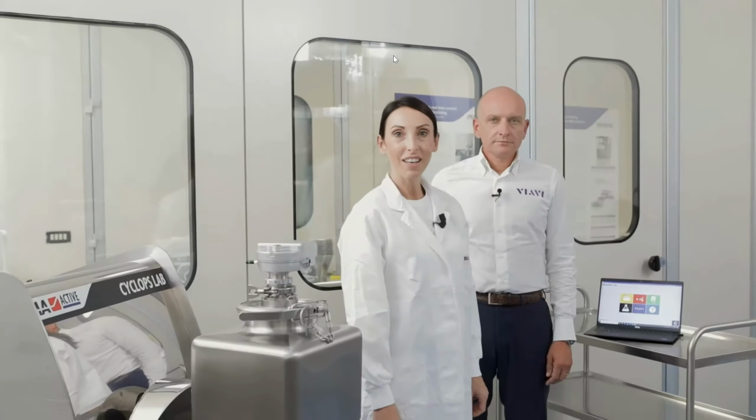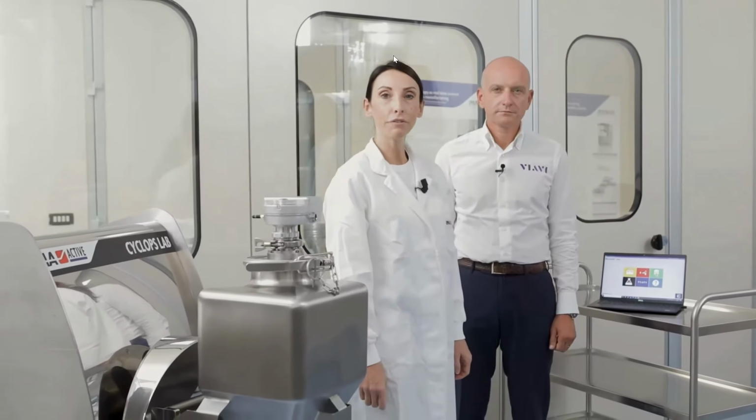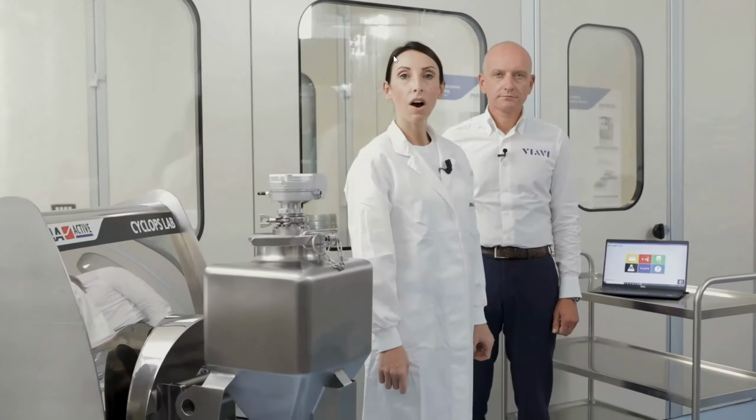Our main goal today is to show you a useful method to monitor and verify the blend uniformity on a binary mixture of powdered components. Before going deeply into the practice, I need to start by talking about the process analytical technology approach, which differs from the traditional approach of keeping the process as constant as possible, minimizing the changes in selection of powder material suppliers, process parameters, and method of analysis.